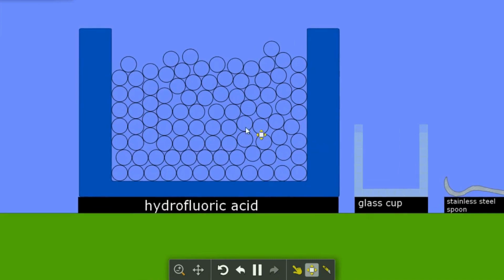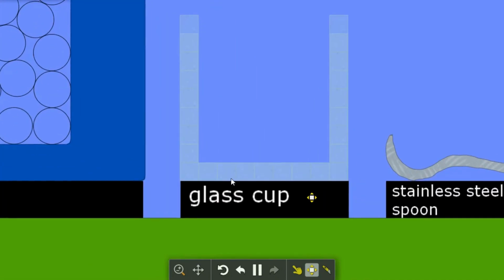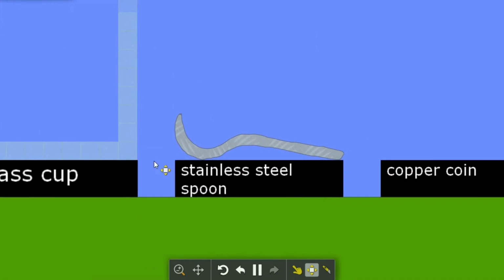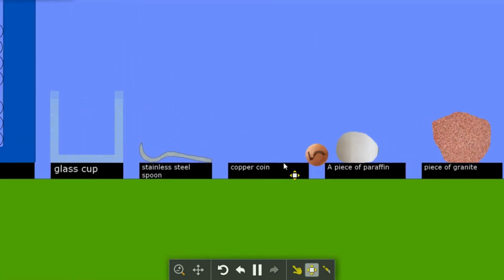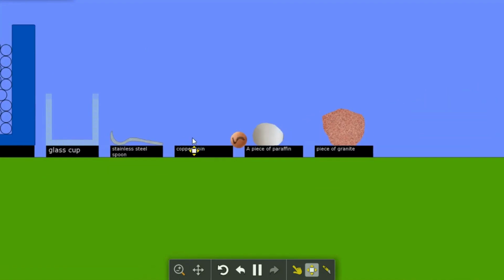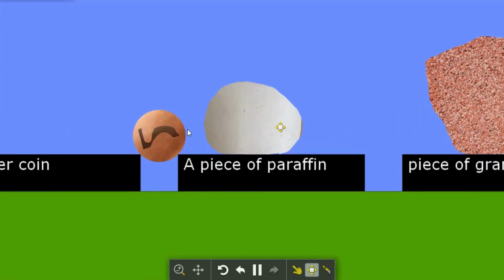For our experiment, we will need hydrofluoric acid of 40% concentration, which we store in a plastic bottle, since it does not react. Goggles, gloves and a respirator, since hydrofluoric acid is very toxic and dangerous to the skin, eyes and respiratory tract. A glass, a stainless steel spoon, a copper coin, a piece of paraffin and a piece of granite.